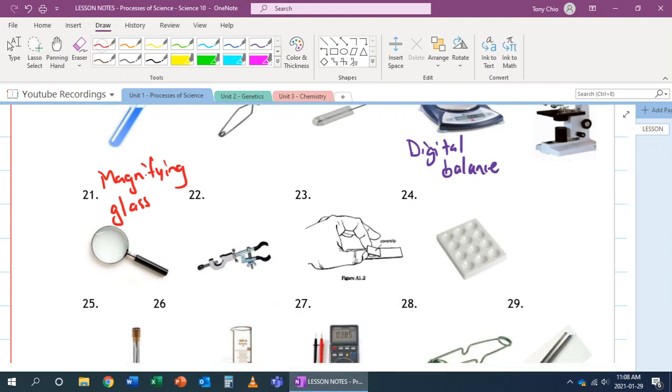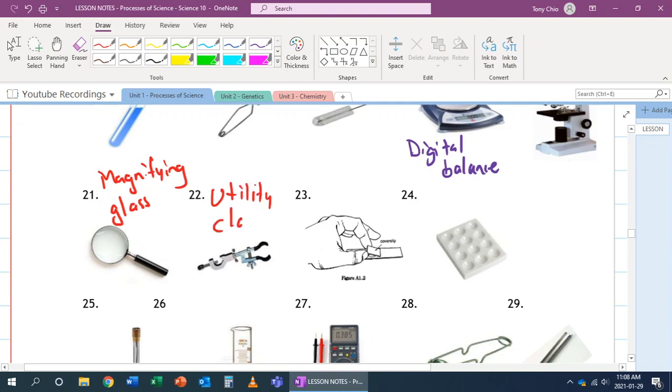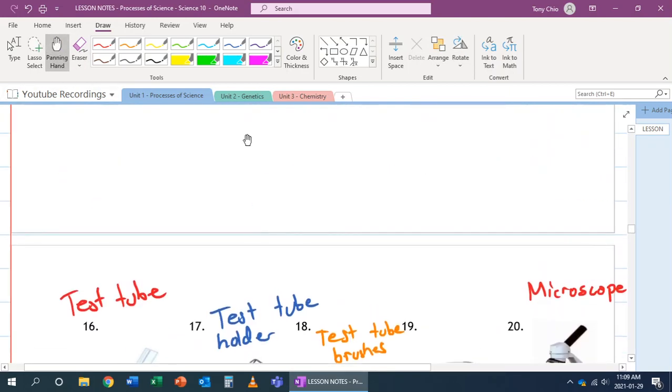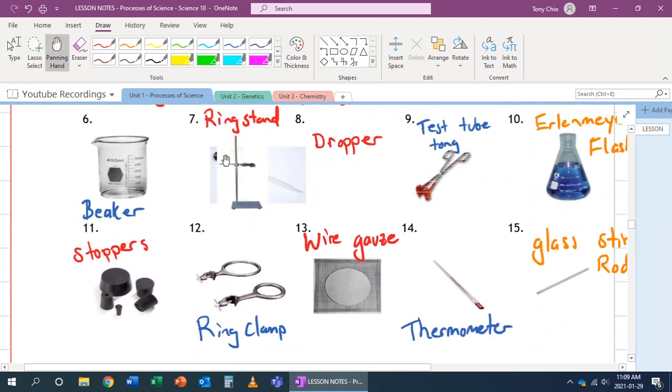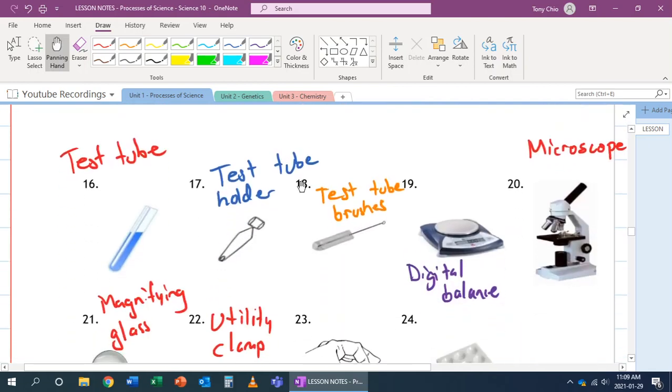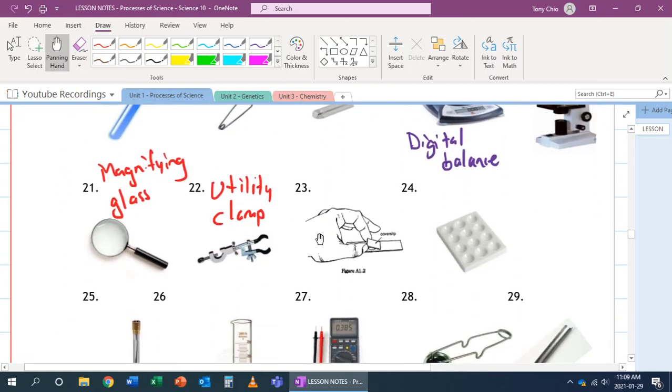22. That's called a utility clamp. It can hold on to objects right here, for example, a flask or a test tube, and it attaches itself to this ring stand, for example. And thus, you don't have to use your hands to hold on to this object.